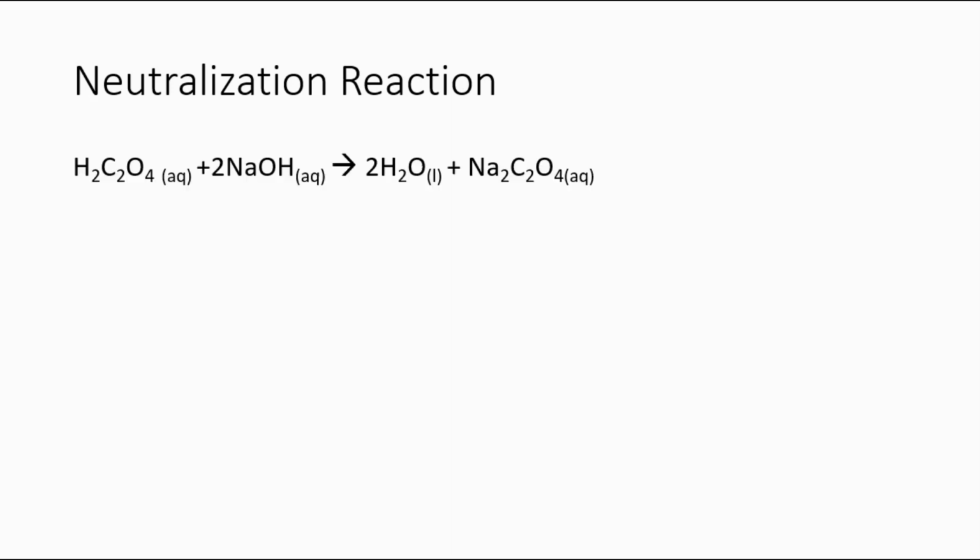So in this experiment, the acid used is a weak acid called oxalic acid. It's H2C2O4. And the base used is a strong base. It's called sodium hydroxide. And here is our water and our salt.